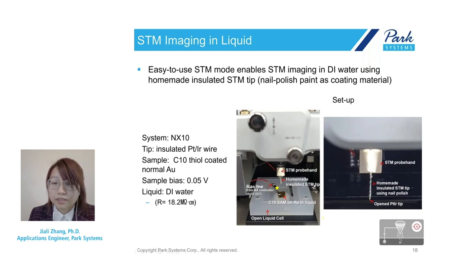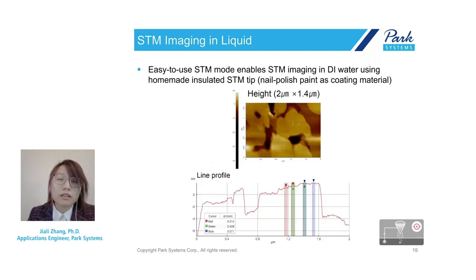All the other setup is similar. We still need to connect it to our internal current amplifier, and we also need to utilize the STM probe head. Now let's move on to our results.